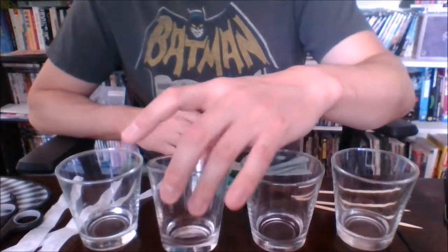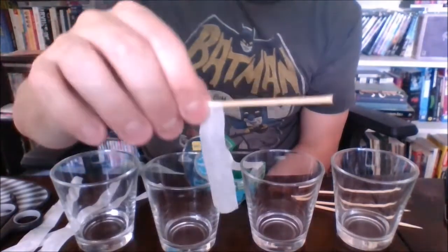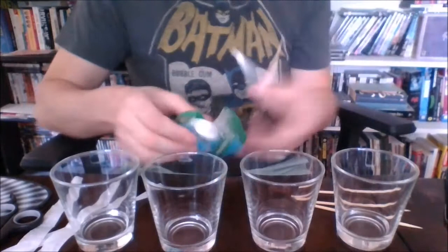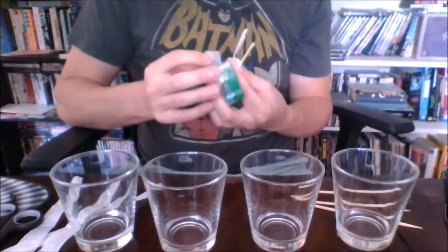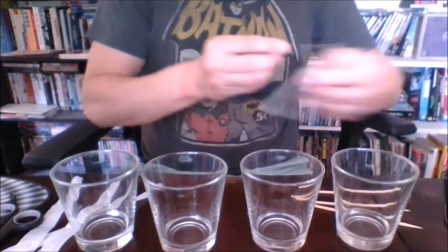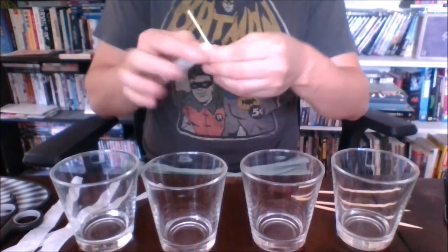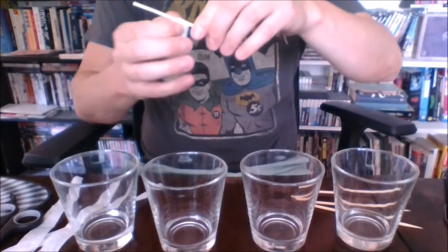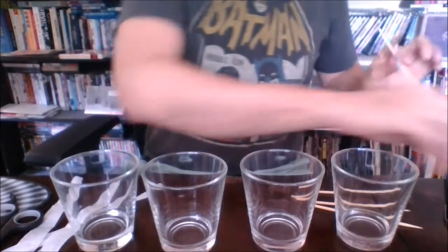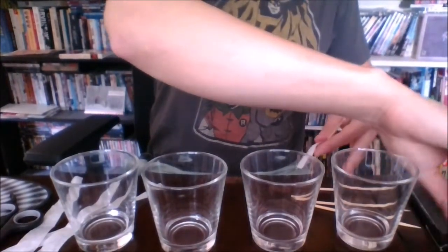We only want the very bottom of this filter paper to get any acetone on it at all while we're doing this. Now that I've got this about where I want it, I'm going to tape it around the stick so it stays in place. I'm going to drop a pen in the process, so I'll have to pick that up in a second. And once it's the way I want it, I'm going to take one of my pens, listing what each one is as I go.